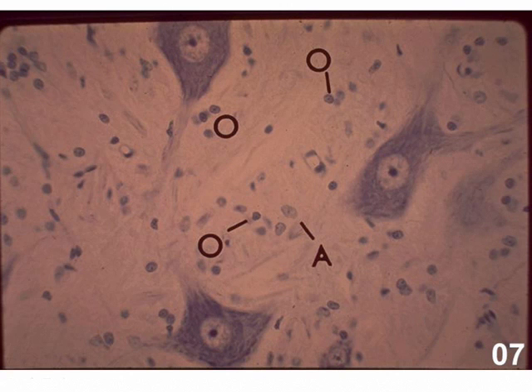Now we're at high magnification light micrograph, and what I'm sure you're noticing immediately are these very large cells with very large euchromatic nuclei and very prominent nucleoli. This is very similar to what you saw in the cell biology video. So these very large cells are the motor neurons of the ventral spinal cord that we just looked at.